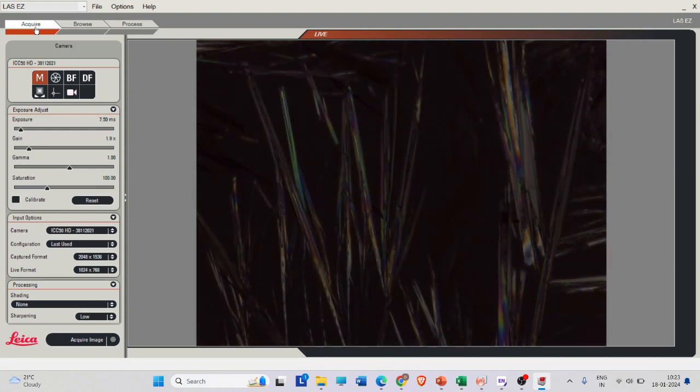Can you see the difference? The different part of the crystals is glowing in a different color also, right? This is due to the scattering as well as diffraction. Light is coming from below, and the sample above is diffracting it, because of that it is glowing, right?